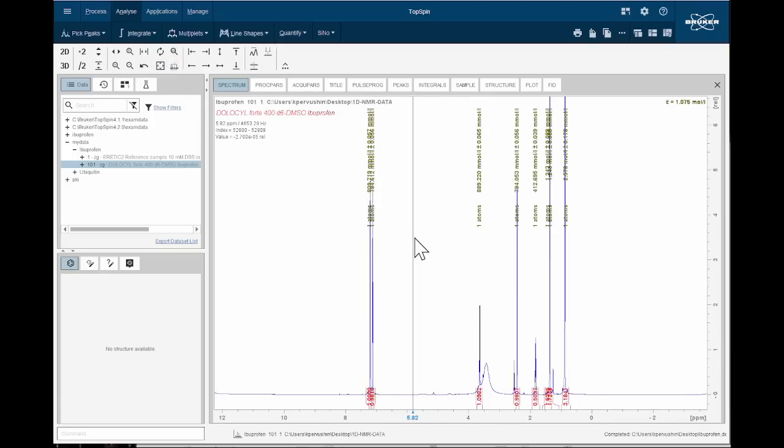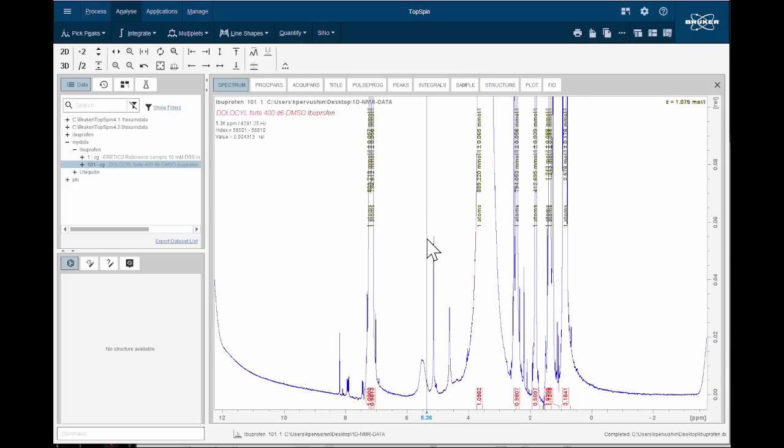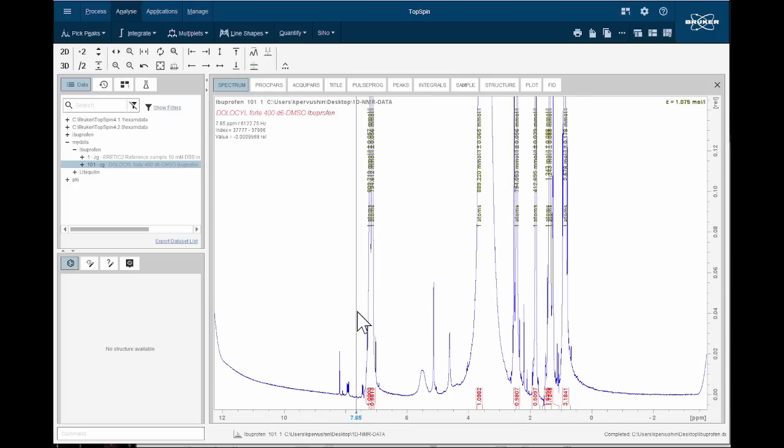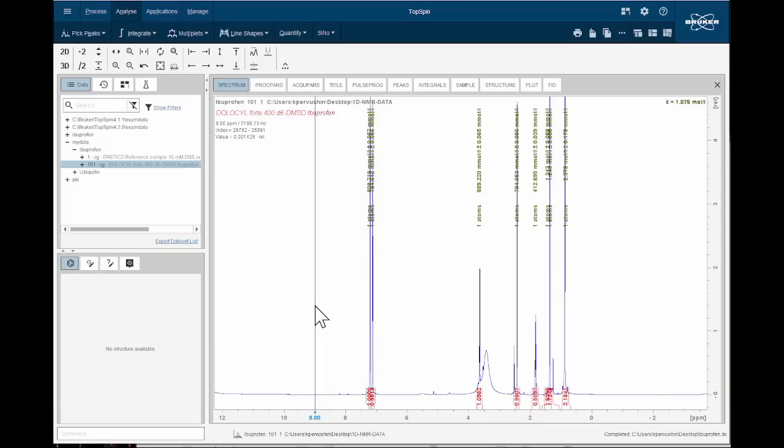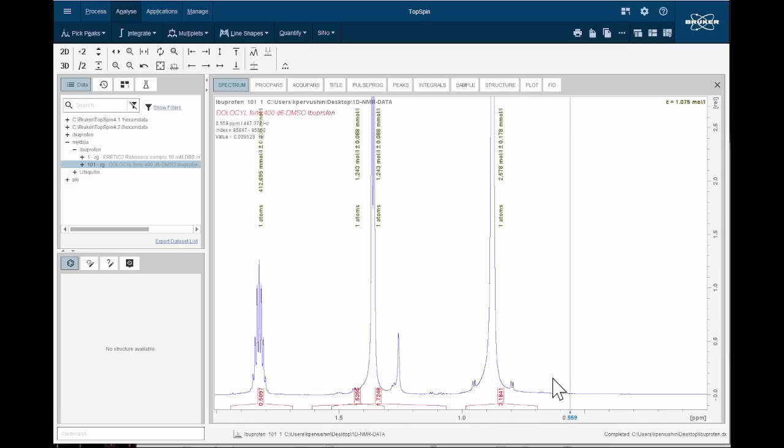So now let's look at the impurities. We can zoom up, and this and other resonances, this one and around here are all impurities. We can integrate them and identify the relative concentration. But they are pretty small, below a fraction of a percent. Let's say this to this peak, it's a fraction of a percent. It's a pretty clean preparation.